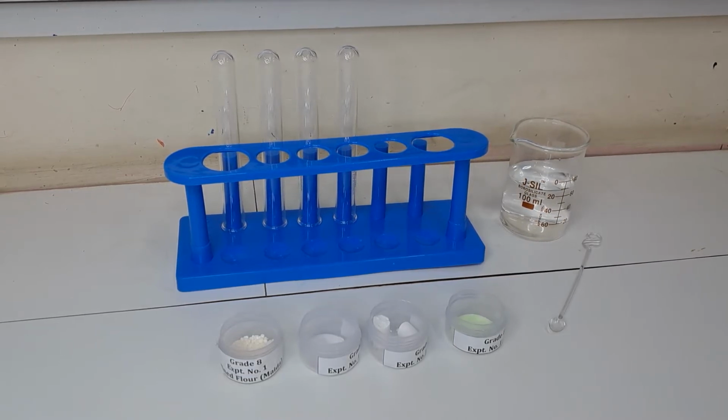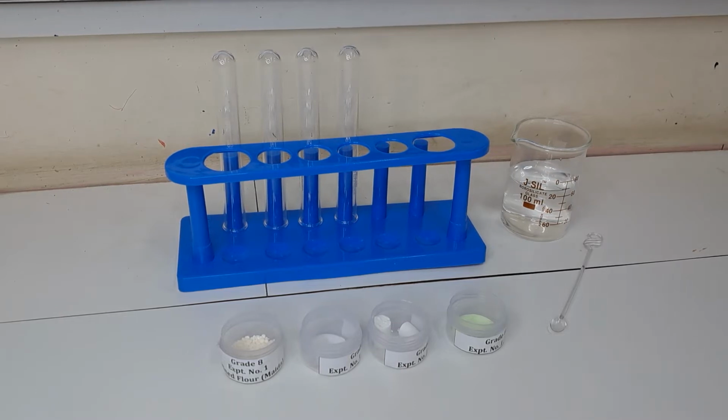The material which is provided to you: a 4 test tube stand, refined flour, that means maida, rangoli, chalk and ENO. We are going to find how these substances are interacting with water. As you know, water is a universal solvent. In most of the experiments, we are using water.